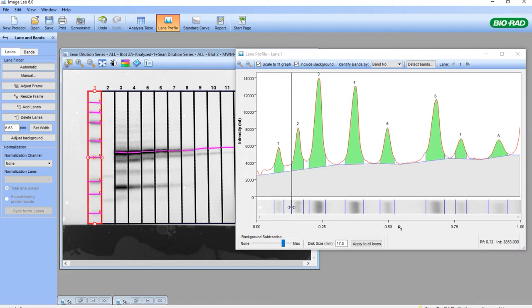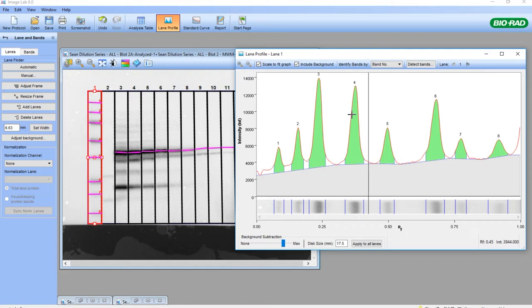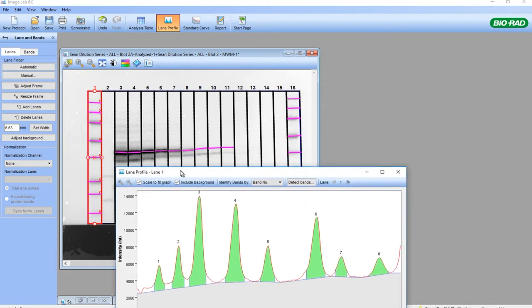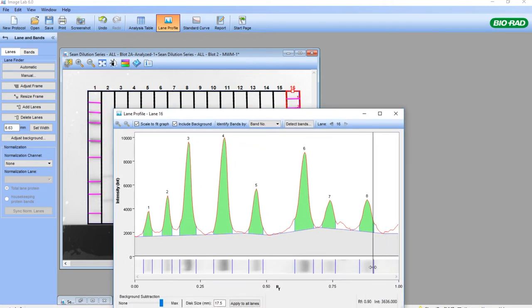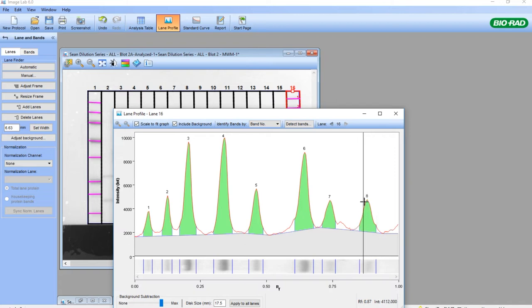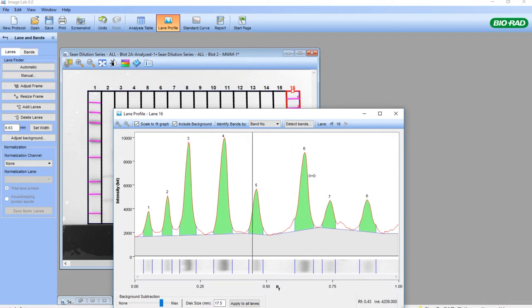These peaks are all very nicely selected already. If I click on the last lane, which is the other marker lane, these peaks are also very nicely selected. You can see how you can click on these blue bars at the bottom to select the peak properly. The goal is to color the peak in green by sliding these bars for each of the peaks.